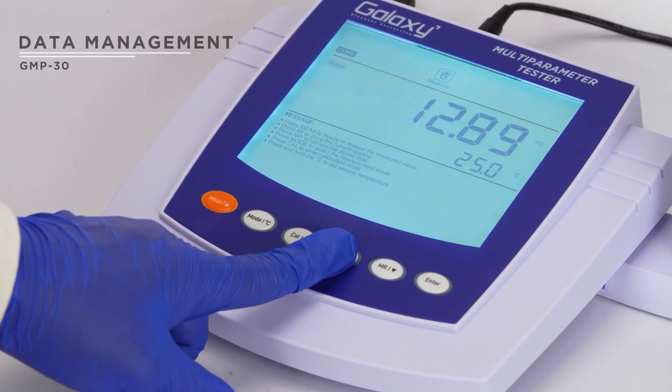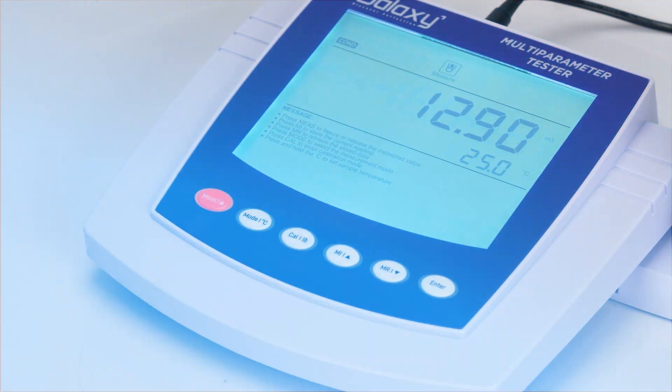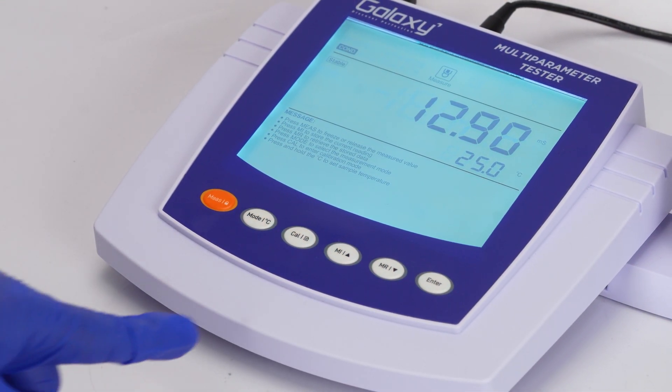Press the MI key to store your readings. To view stored data, press the MR key.